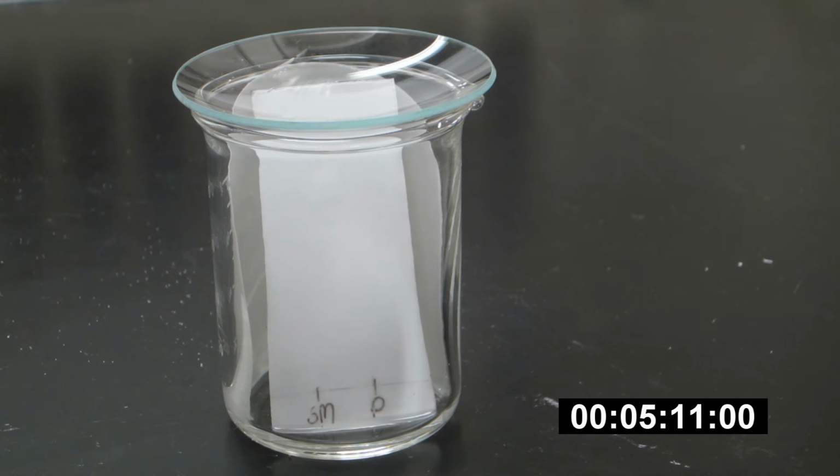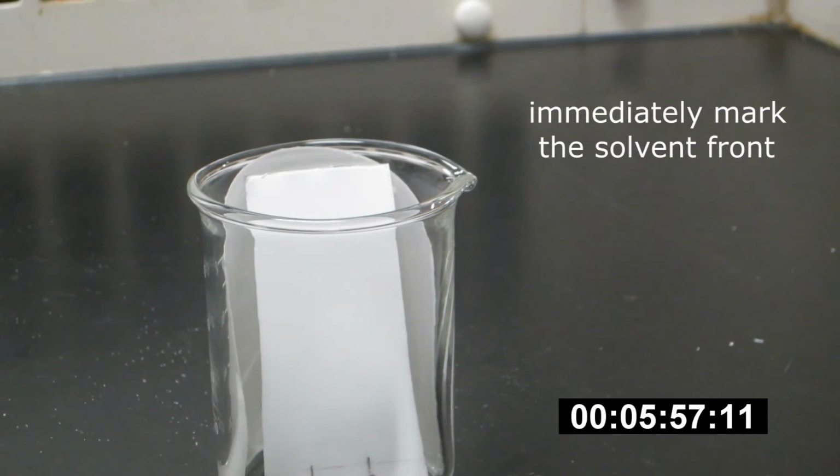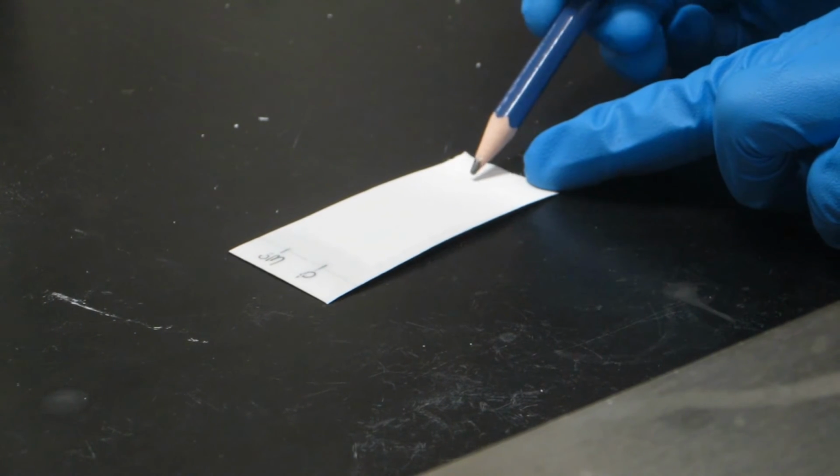When the solvent front is about 1 centimeter from the top of the plate, remove the plate with tweezers and immediately mark the solvent front with a pencil before it evaporates. If you do not mark the solvent front, you will not be able to calculate any RF values. Once the solvent front is indicated, allow the plate to dry before visualization.